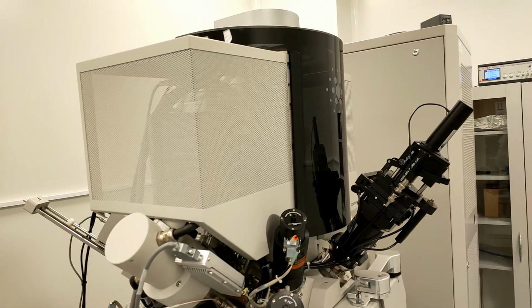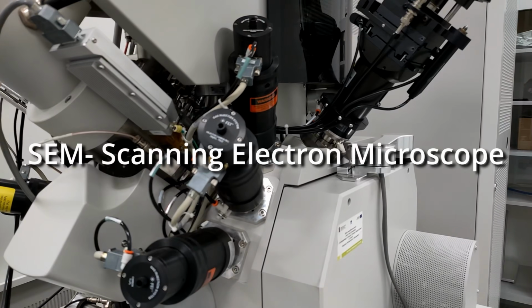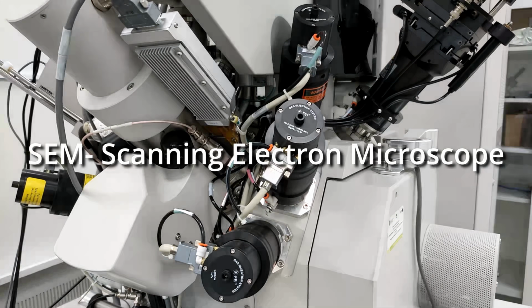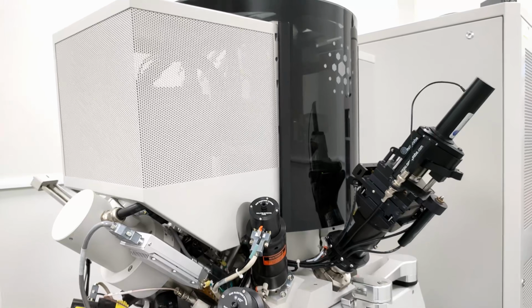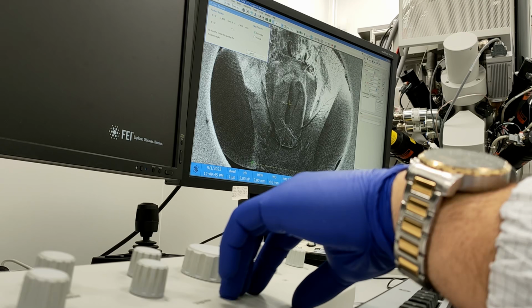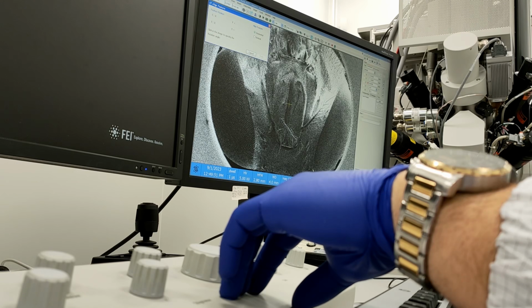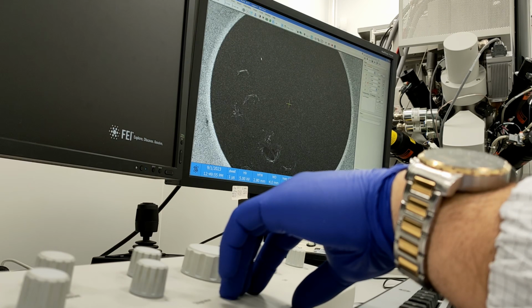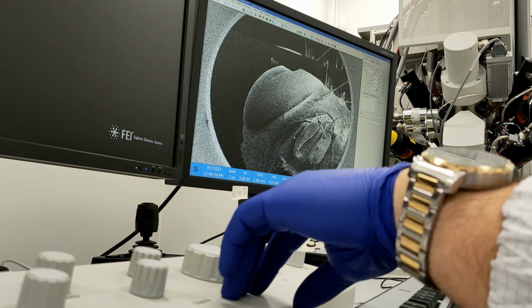The second instrument is a scanning electron microscope, Fei Helios Nanolab 650. It is about 10 years old. At the time of its purchase, it was one of the best microscopes available on the market. Its price was around $1 million. In this video, I will focus only on the most basic scanning electron microscope function, imaging using secondary electrons.